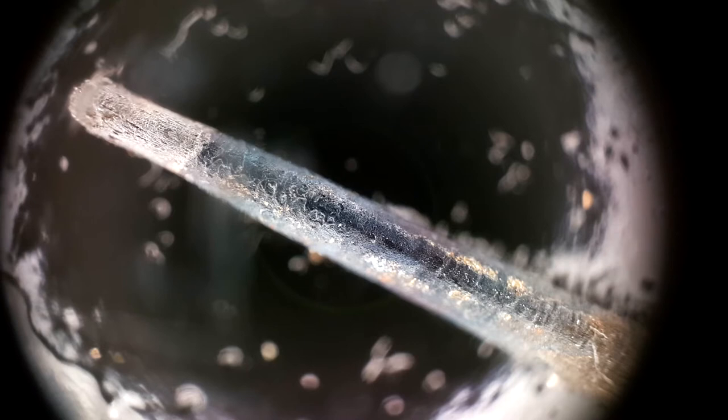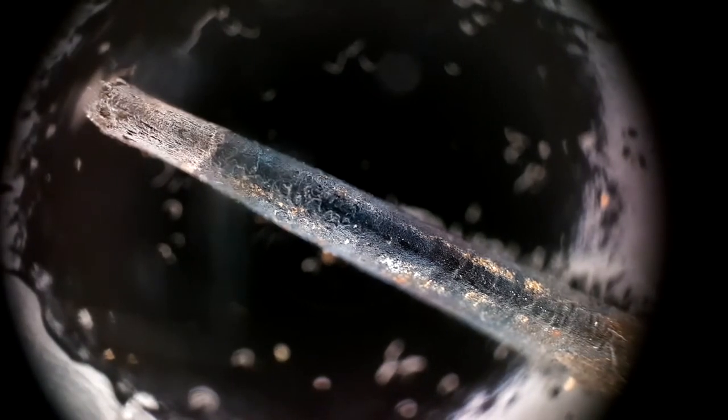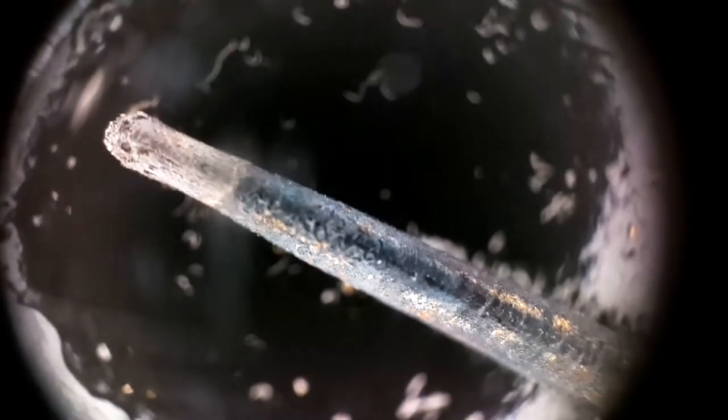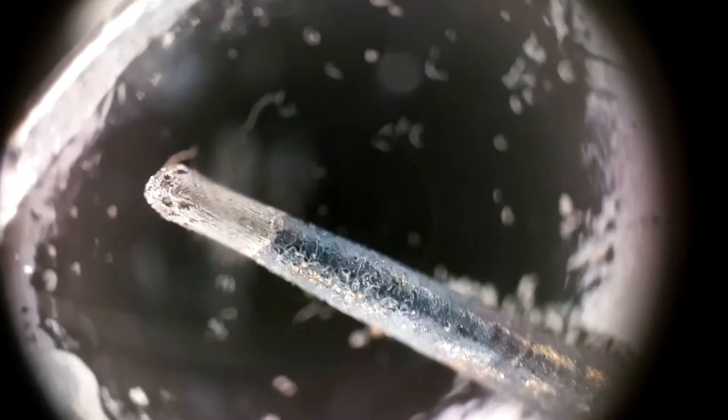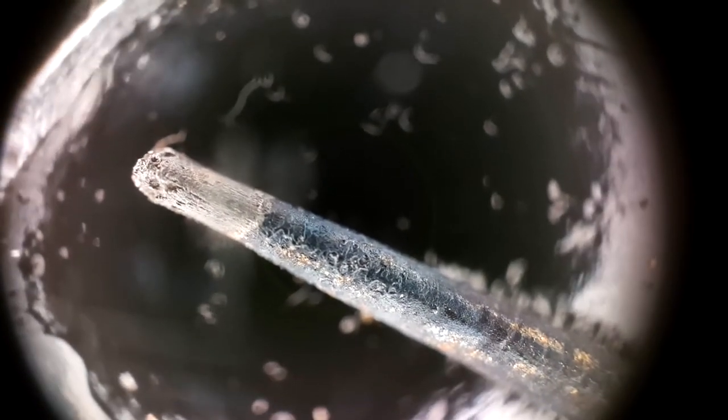and it has three distinct zones. The top area, which is to the left of the frame, which I call the head, then there is the neck, and then the collar. So this is color microscopy, and we're just gonna have a quick look around this, try and move it out of the blur zone of the scratched lens here.